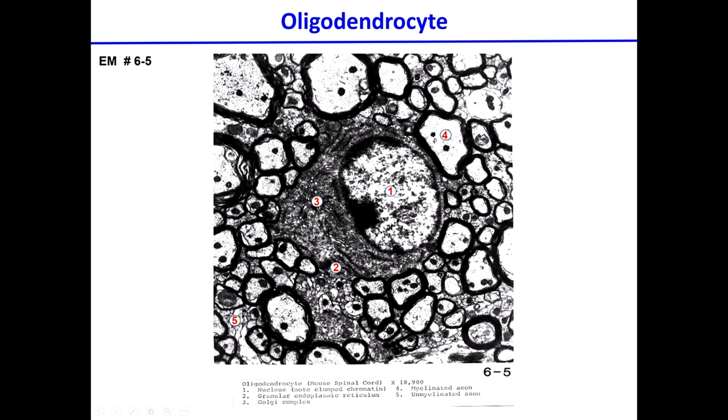But this thing here, I'm going to try to delineate it for you. This thing that goes, and then it goes under the number, this is a non-myelinated axon. Okay. You can tell easily which is myelinated and which one is non-myelinated. Whether you can see that it's an axon or not, that's a different story. Questions?